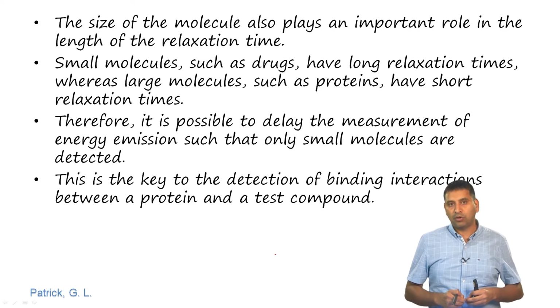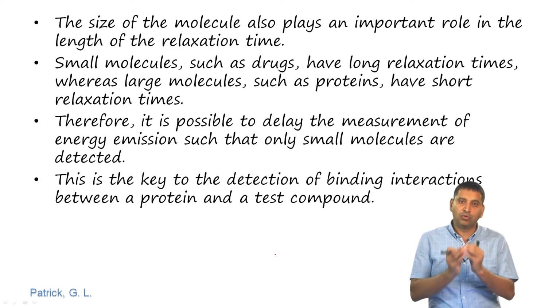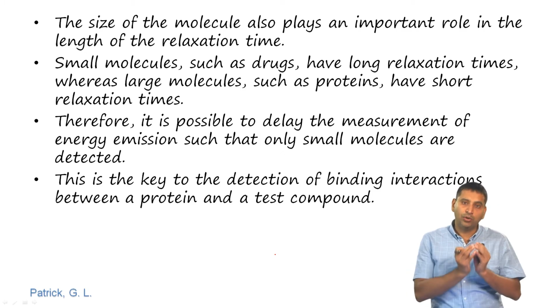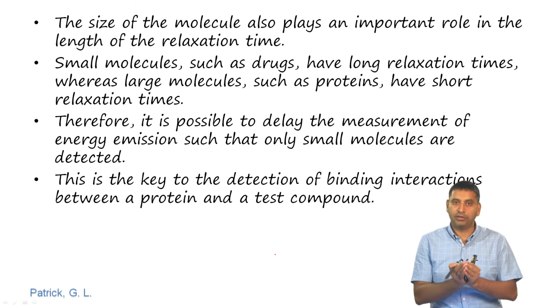So, it is possible to delay the measurement of energy emission such that only small molecules are detected. So, when we are doing an experiment where we want to study binding of a protein with a test compound, you can use NMR spectroscopy for this purpose by delaying the time taken for the measurement.